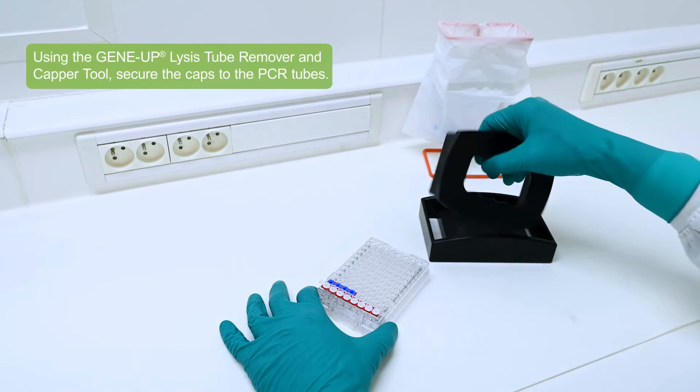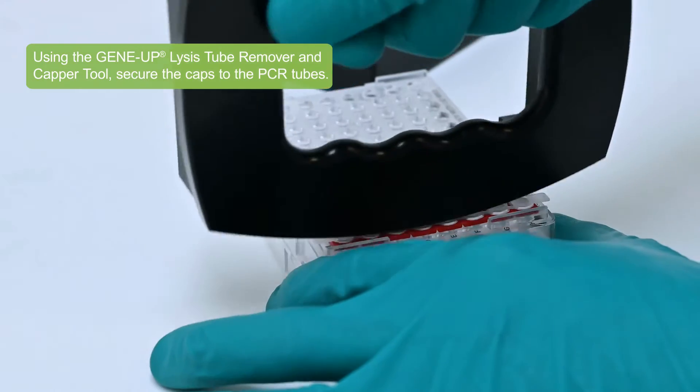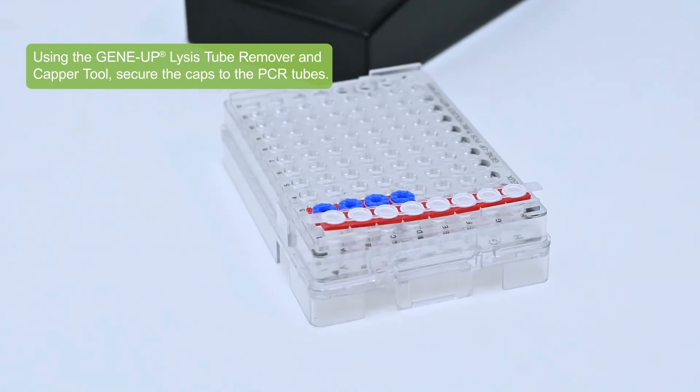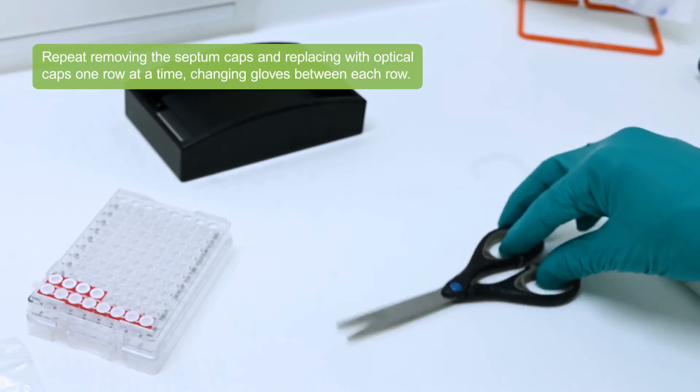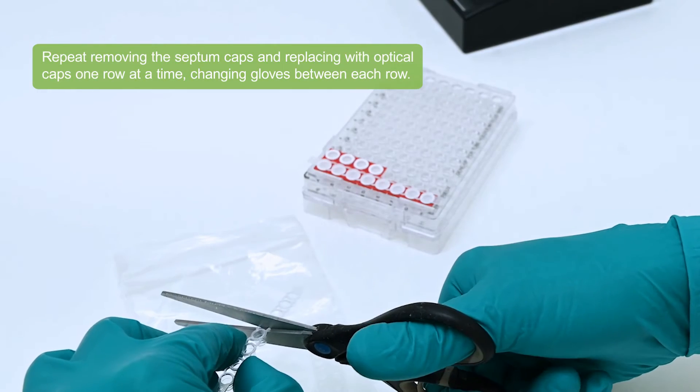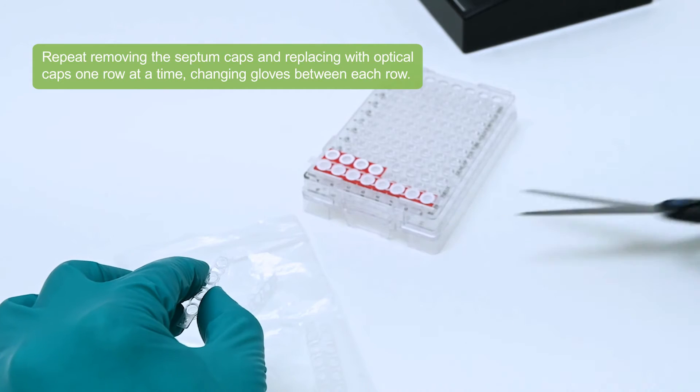Using the GeneUp Lysis Tube Remover and Capper Tool, secure the caps to the PCR tubes. Repeat removing the septum caps and replacing with optical caps one row at a time, changing gloves between each row.